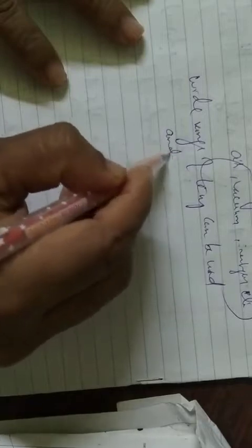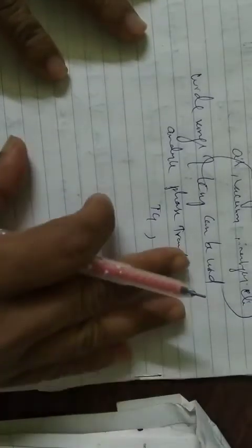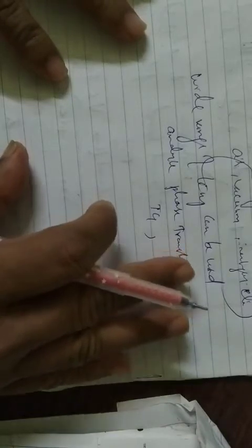And a wide range of temperature can be used to analyze the phase transition, that is your glass transition temperature, Tg, or crystallization temperature. So this is what we can see as the advantages of this DSC.